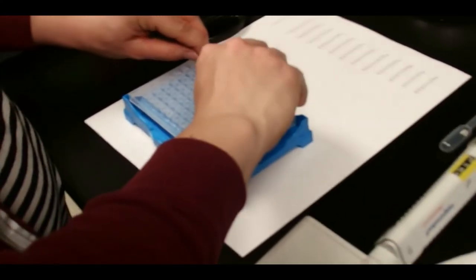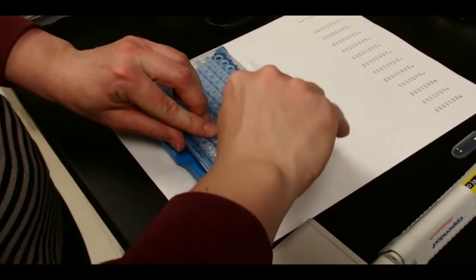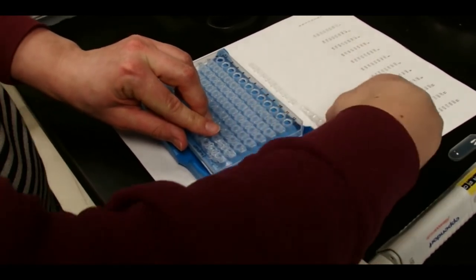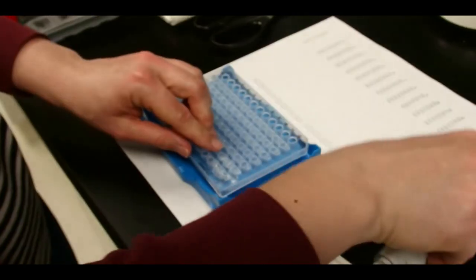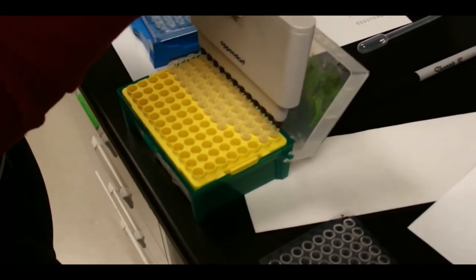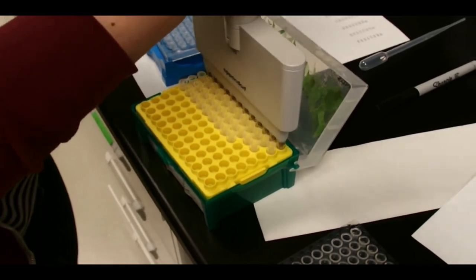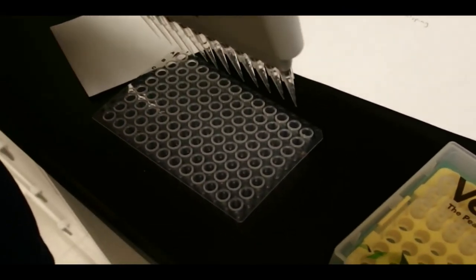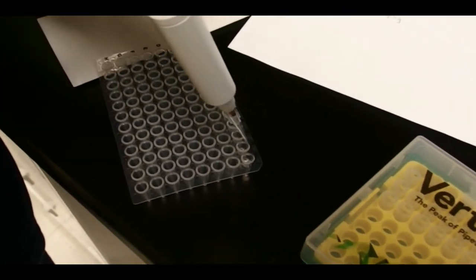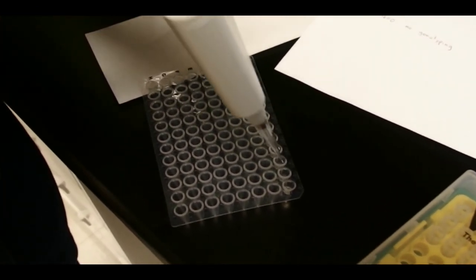All right, so after these guys are heated, we need to add the dilution buffer from Sigma. Sarah's going to be smart and she's only going to open up what she's going to pipette in. And here are your... a whole row of 12 at once. We have the dilution buffer aliquoted in this. We're using this plate as a reservoir. You could use a reservoir as well, but this works.